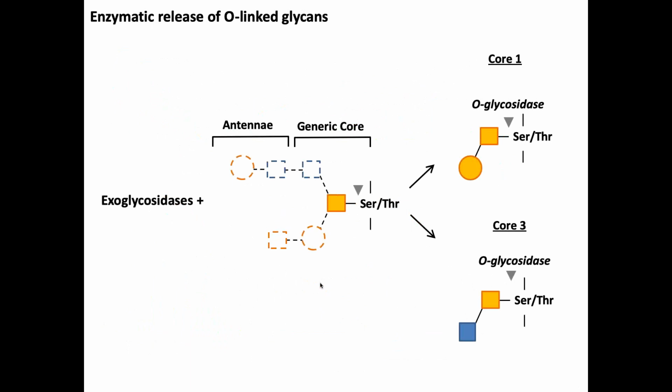For the most part, these approaches were generally used where you've got a fairly simplified mixture of an individual protein that you've IP'd or purified, or it's His-tagged, or it's a recombinant protein, something that gives you enough material to do these different types of experiments.